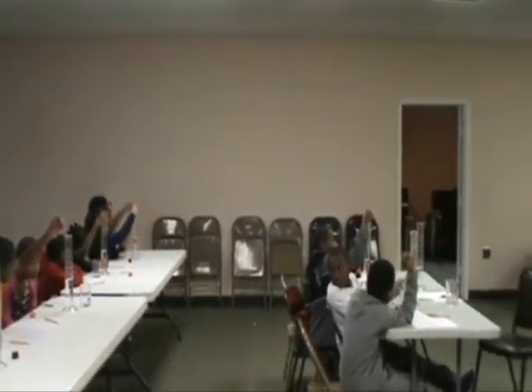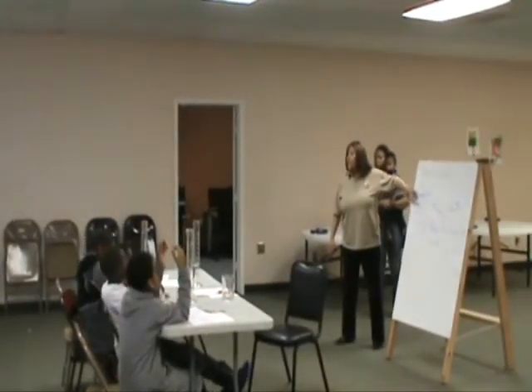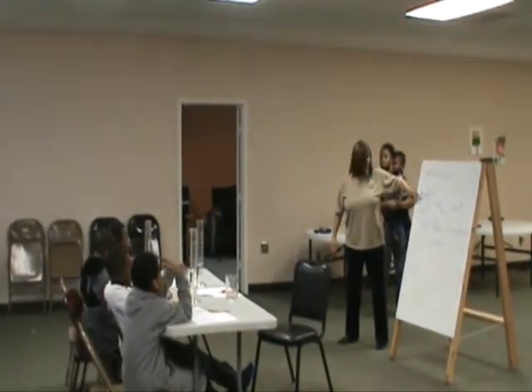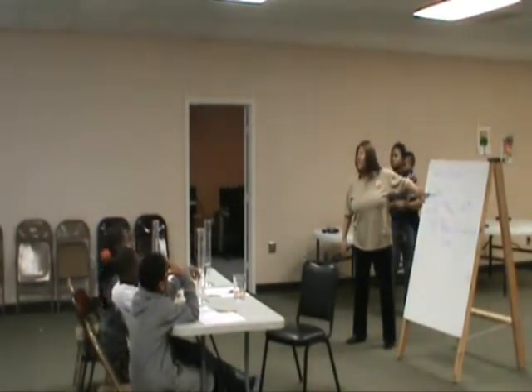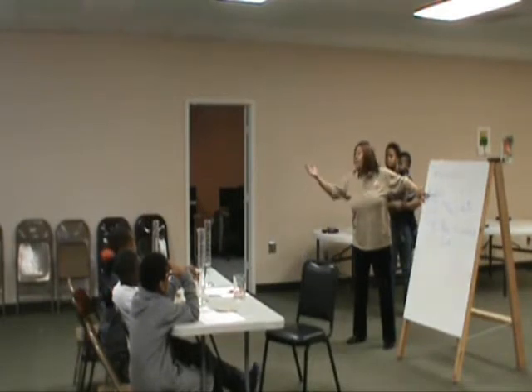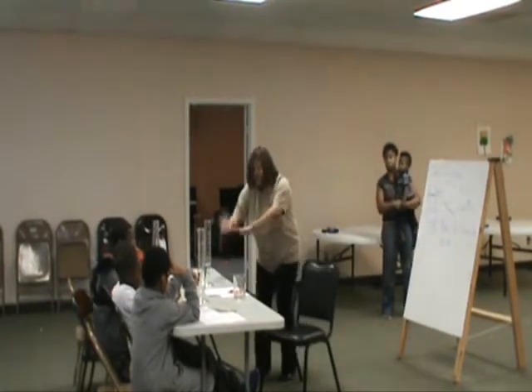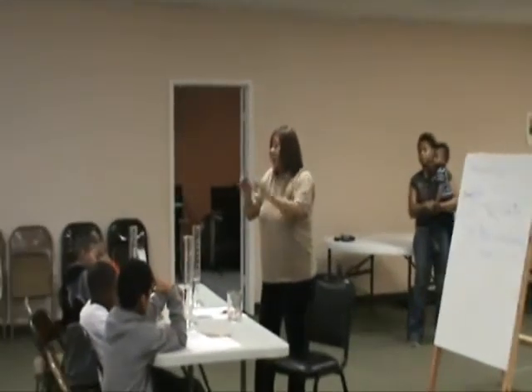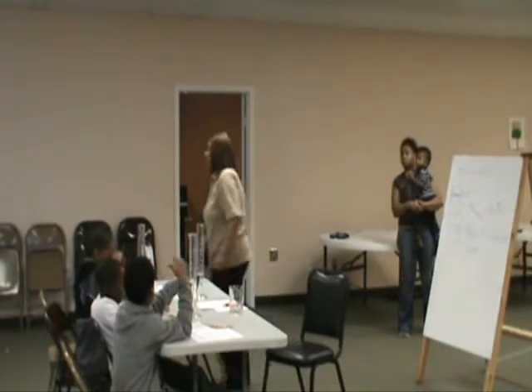I just want all of y'all to peek up here right quick. Just look up here, ladies, gentlemen, students. Give me one eye up here. You see this green curve? This is called the meniscus. Let me say it: meniscus. The bottom of that meniscus must sit perfectly like this. Look, it must be on top of the line. And I need to see a perfect meniscus right now. Yes. You can do this. You guys are great.